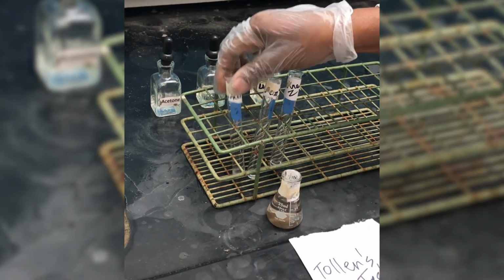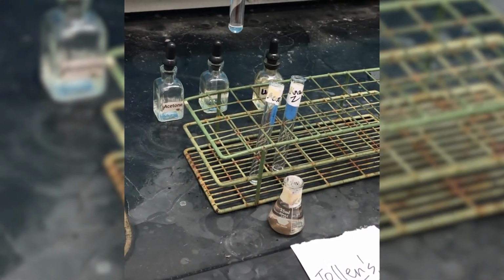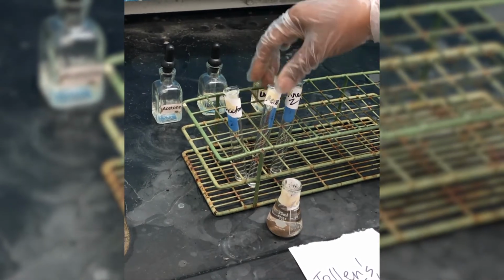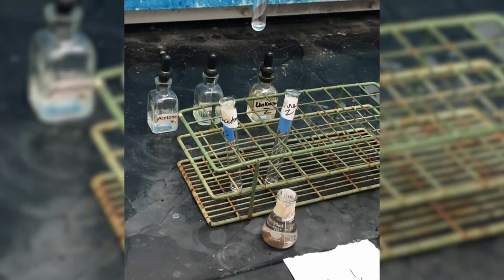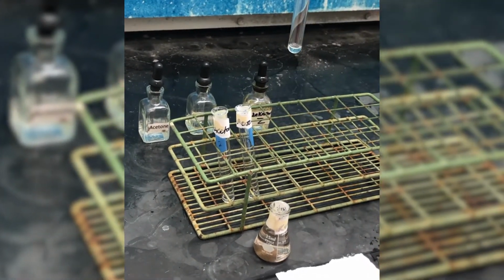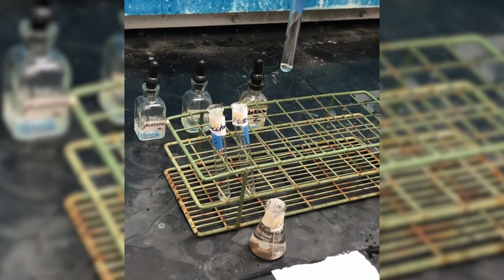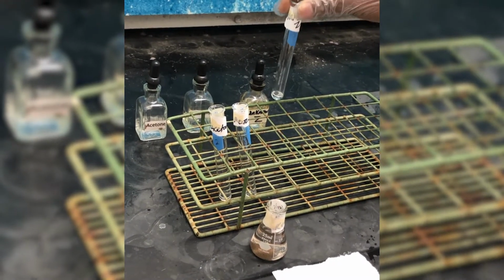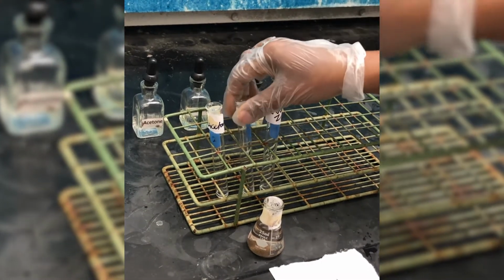So I have already put a few drops of acetone in this test tube, and here I have benzaldehyde, and in the third test tube I have our unknown Z. Unknown Z can either be an aldehyde or a ketone.